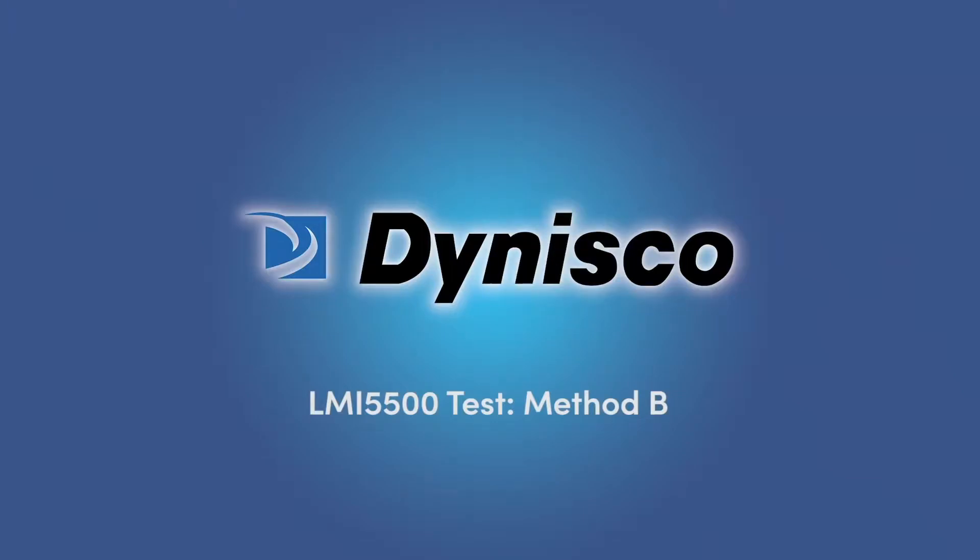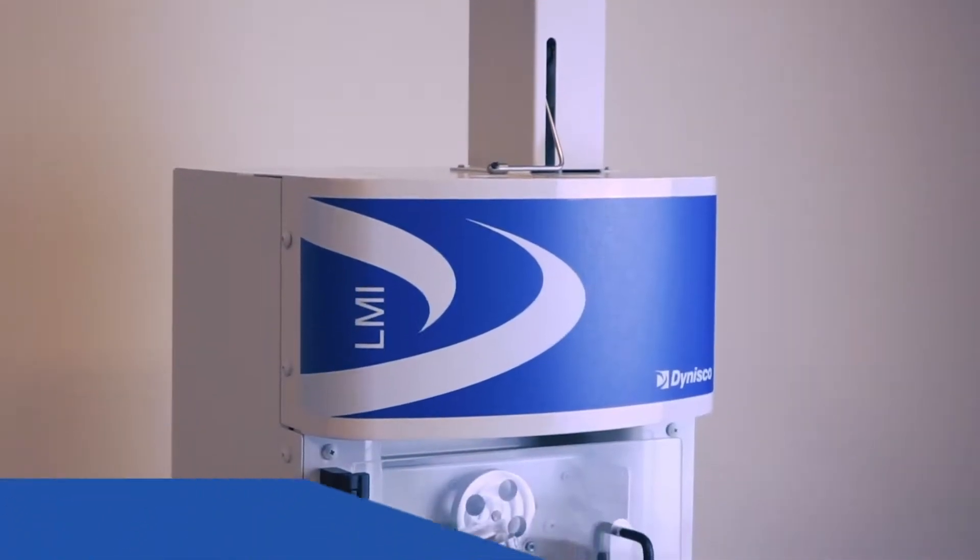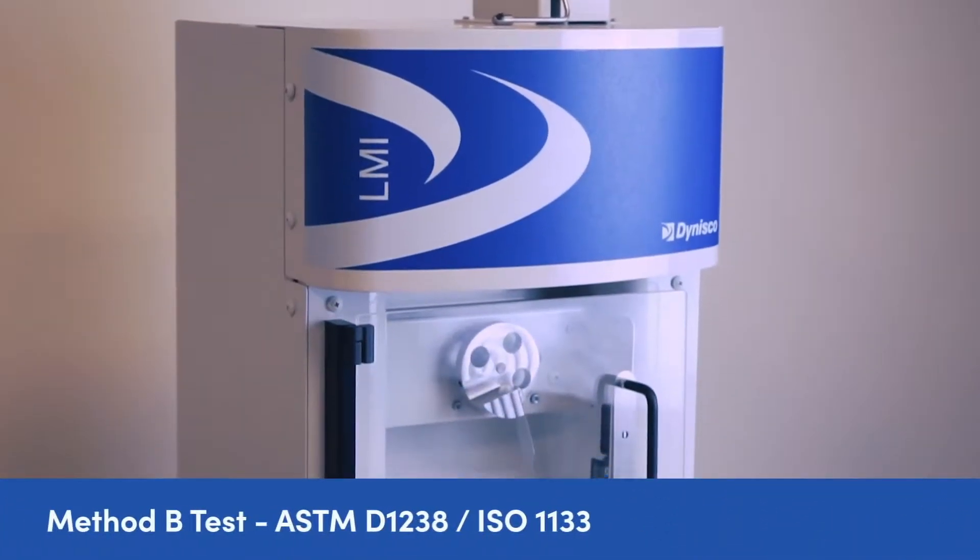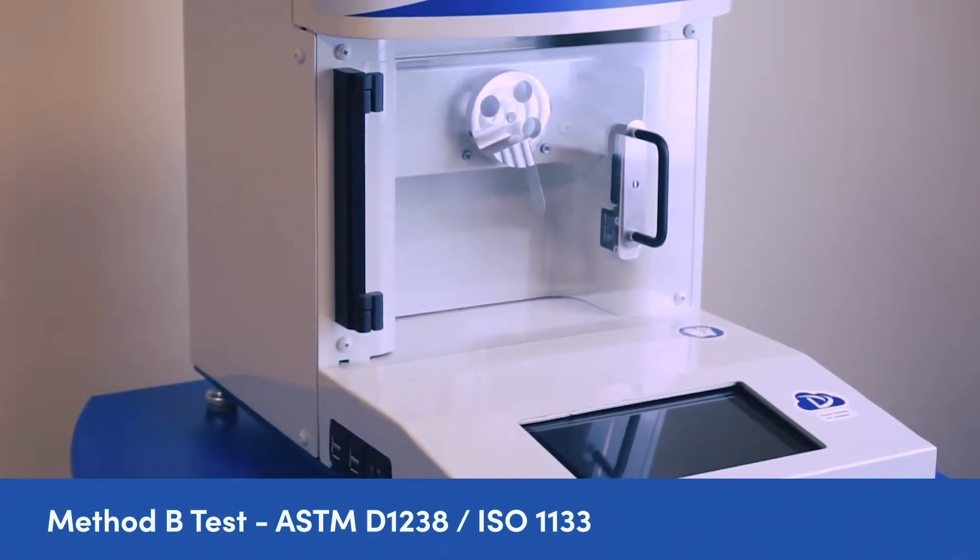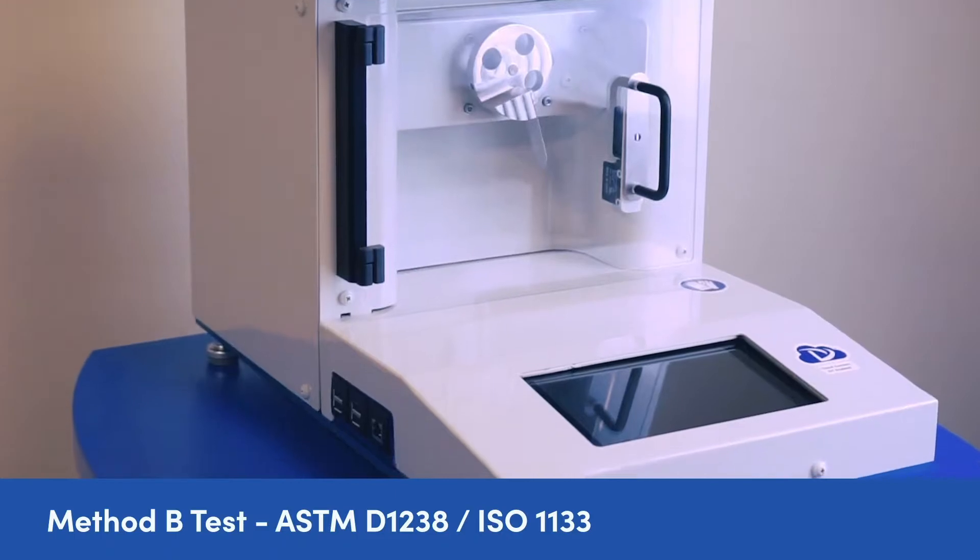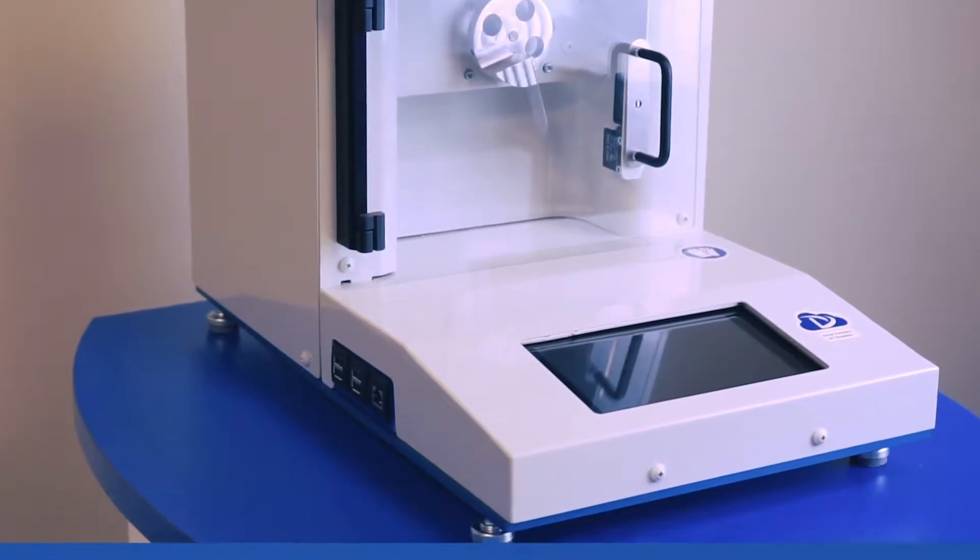Today, we will look at the LMI 5500 series melt flow indexer machine and the Method B test per ASTM standard D1238 or respective ISO 1133 standard.